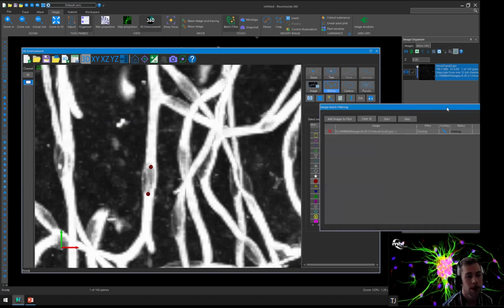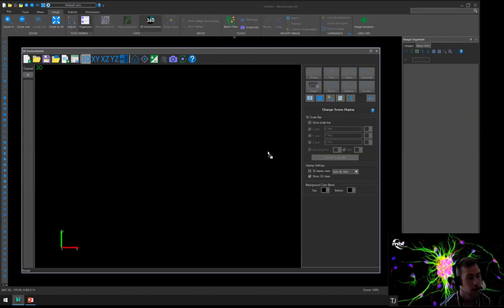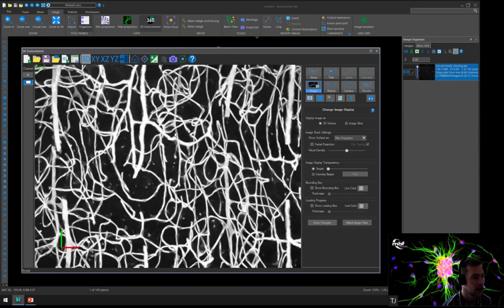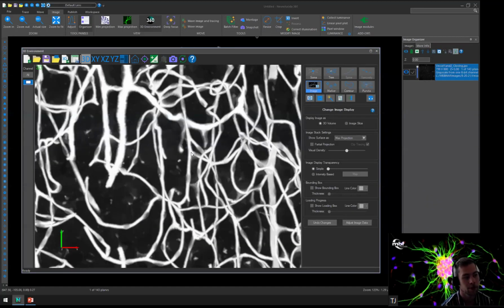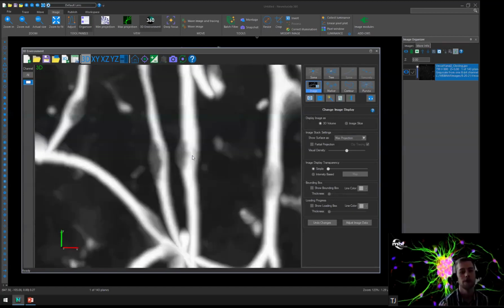So when we bring in our closed filter, we can see that in that area, I think we were right here, some of those pixels have been blurred together and the intensity of that staining has been pushed just a little bit. So the morphologic closing filter is a way to close smaller sections that might be created, whether there's a little punctate staining happening, or a varicose spot. Those smaller sections are going to be more attributed to that filter.